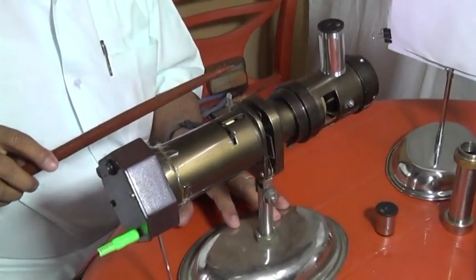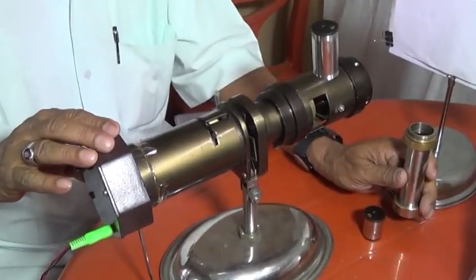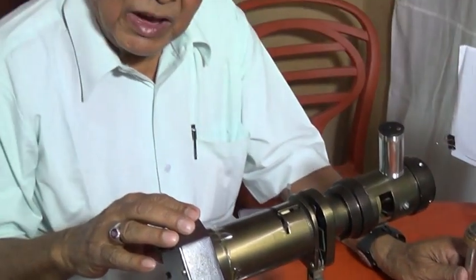This is my Innovative Microscope Come Projector. It is integrated of my Innovative Microscope and Microscopic Slide Projector.